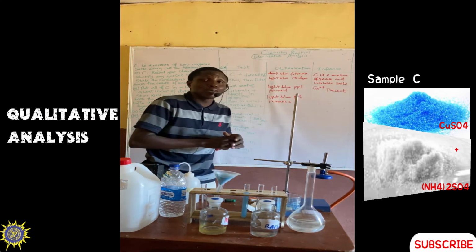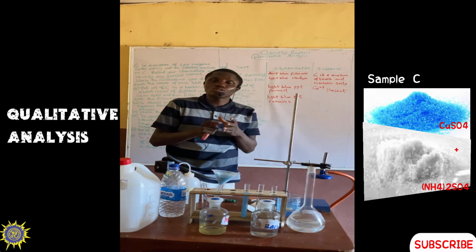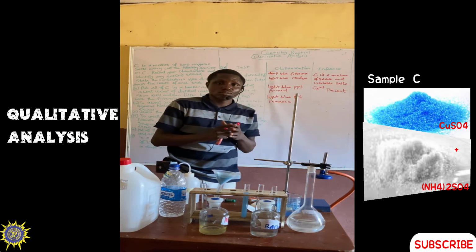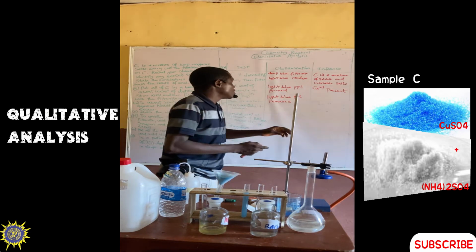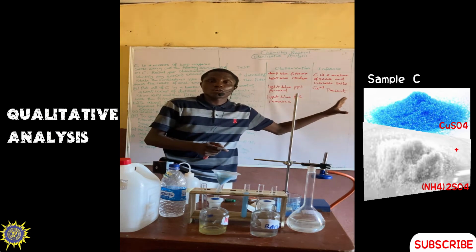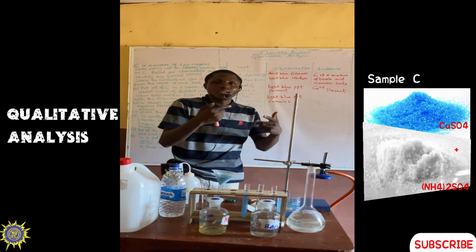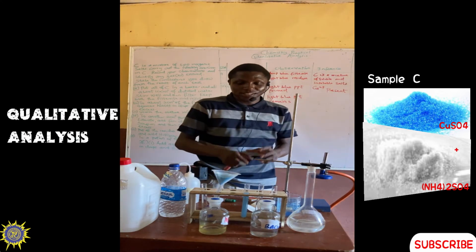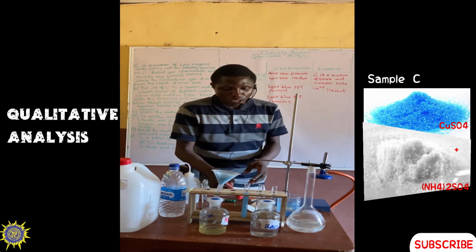Copper ion does not dissolve in excess sodium hydroxide. The blue precipitate remains when you put any copper-containing compound inside aqueous sodium hydroxide. There's no change, it does not dissolve, and does not become a deep blue solution. So that's that about that.